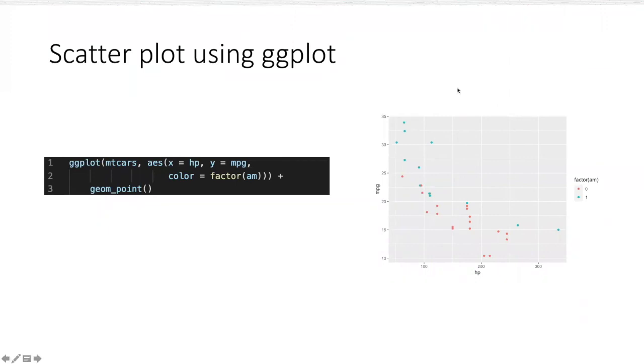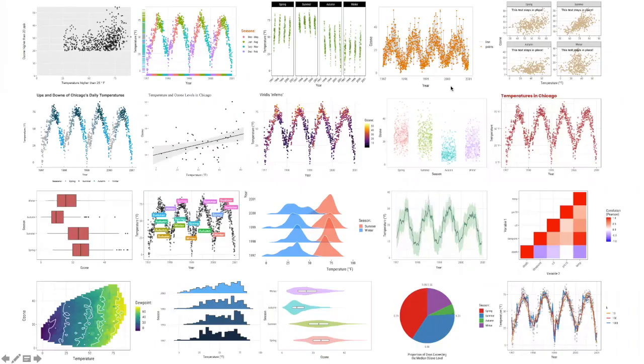above that. And actually, ggplot doesn't only do scatter plot. It does all kinds of plots. If you want to plot scatter plot, histogram, line plot, heat map, pie chart, box plot, ggplot can do this, right? Probably I would say at least 90 or 95% of your visualization tasks can be realized in ggplot.